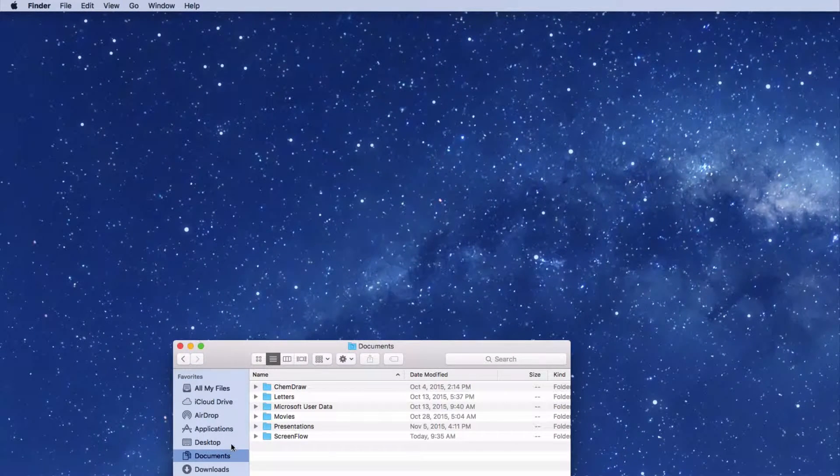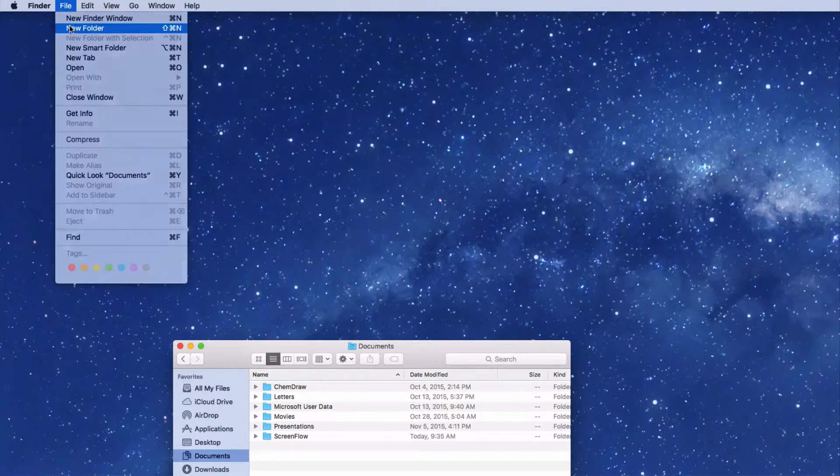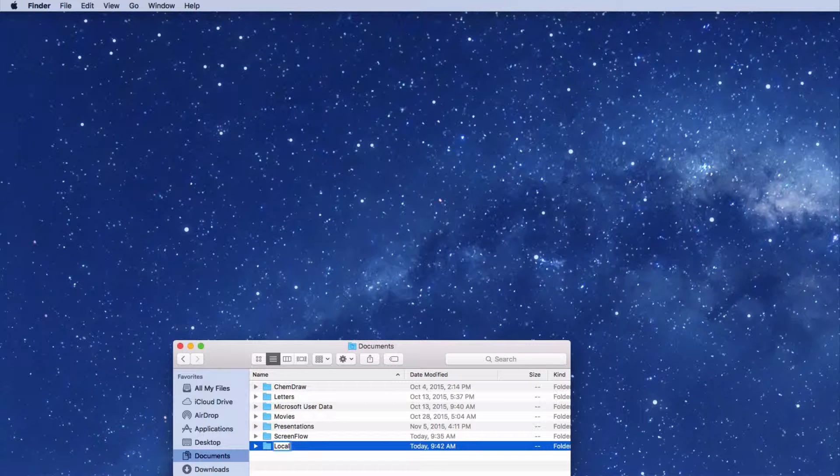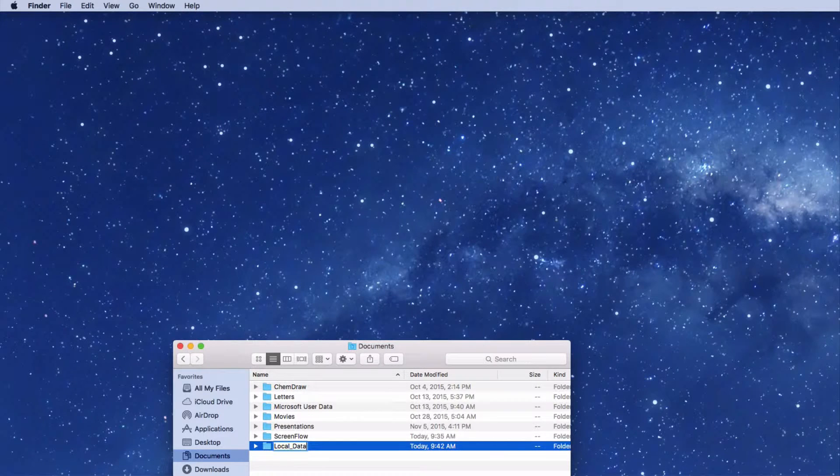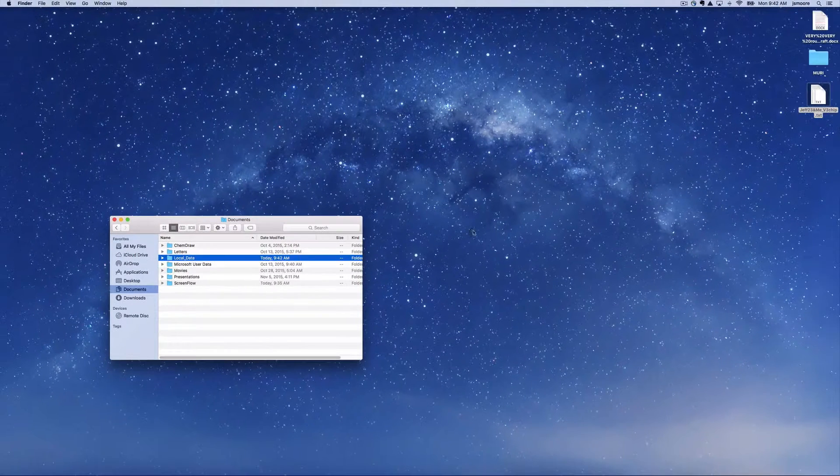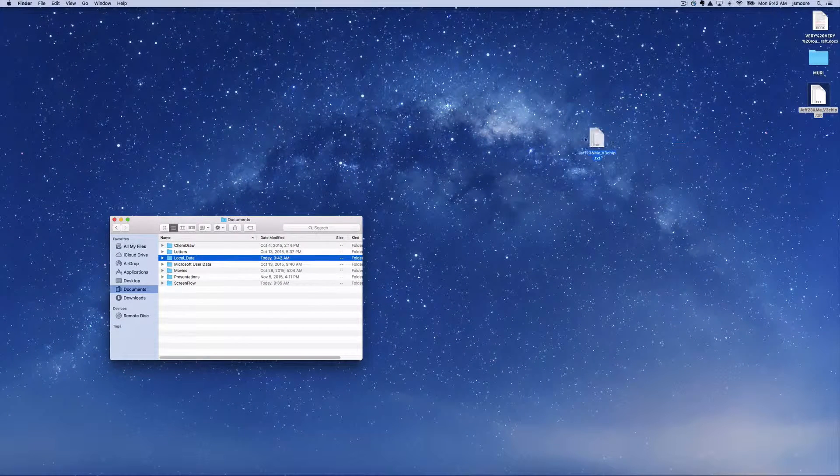I like to place all my data in a single folder within documents. Let's call the folder local data. Move your data file into the local data folder.